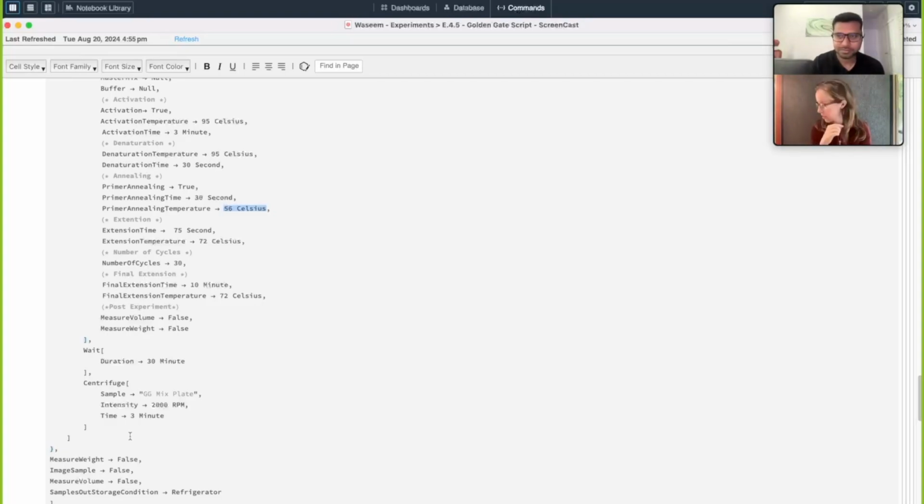And something to think about. Remind me quite how this works. Sometimes centrifuging is really easy because the centrifuge instrument is physically on the same instrument that the pipetting is happening on. And other times, if you add a centrifuge step, it'll cause your protocol to take way longer to run because an operator needs to move it somewhere totally different.